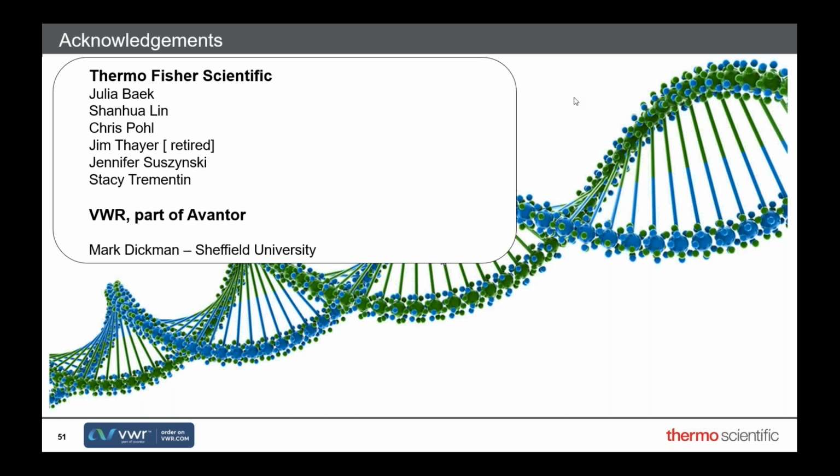One, you can actually just run it and try looking at the MS, with the MS going to as high a resolution as you can, and see what you can separate on some of those peaks. You will get a separation of some things, especially with the DNA Pac RP. You've seen the 500 base pair separation you had on one of the earlier slides. That'll still be available. But if you've got N-1s, N-2s, you'll not see it, but you can delve into the MS and start looking for that.